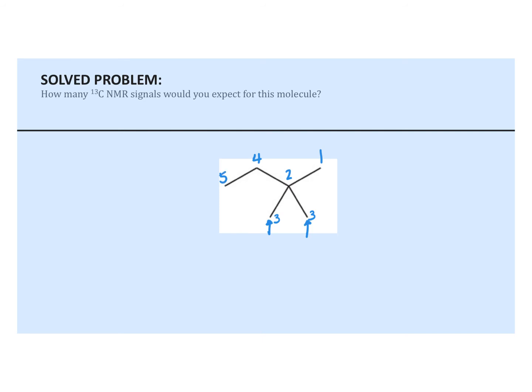Now, I always want to go back and look, and I can already tell, because I started from the wrong side, that I've made a mistake. And my mistake is that that's also a methyl group. So that is going to be in the same chemical environment as well, right? Because that's a methyl, and that's a methyl. So all those are methyls, right? So they're going to be in the same one. And so let me just erase and renumber, because it looks like there's just going to be 4.